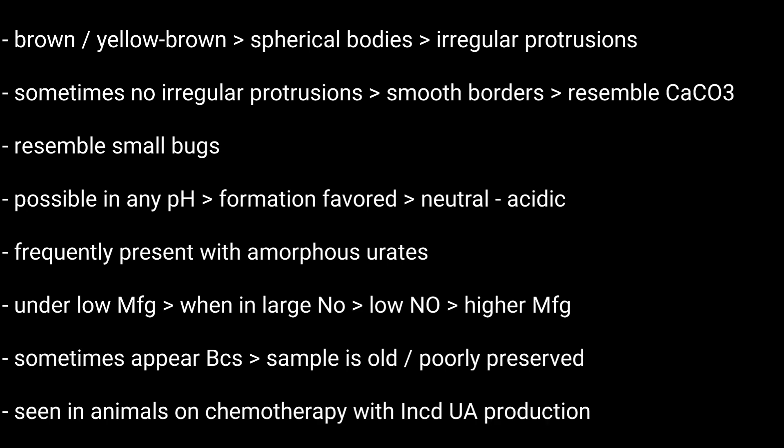They have been seen in animals on chemotherapy with increased uric acid production.